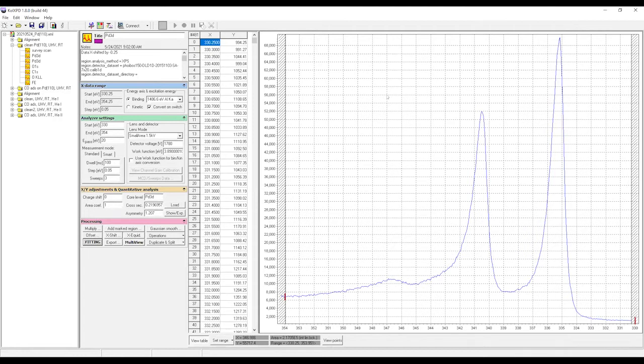Usually we don't do this because you need to work a bit to connect a special analyzer. However, it is possible because it has different functions for different motors. As soon as you know how to connect it, it's not a problem.